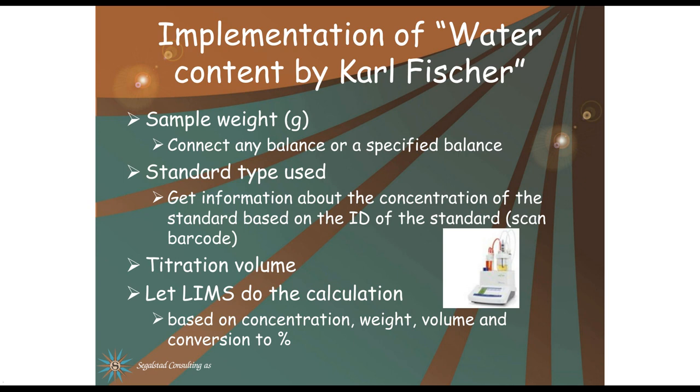When we set this method up as static data, we can either just state that we need a balance and have the operator input the name of the balance used, or we can say that we always use this specific balance, which the operator can or cannot overrule if that is necessary, and the can or cannot is something you set up. We enter the type of standard that we use so the operator can scan the label on the standard. That will give information about the concentration of the standard based on the ID of the standard. We scan the barcode.